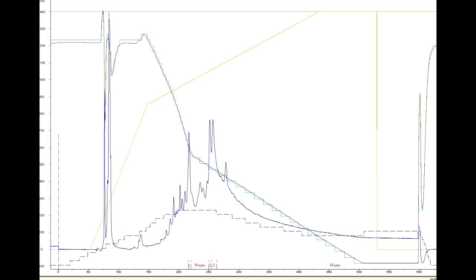All that information seems a little confusing, so let's try to apply what we know about the fraction collector to analyze the chromatograms that have already been done. We can understand how the fraction collector works a little better if we check out one of the chromatograms that's already been done.